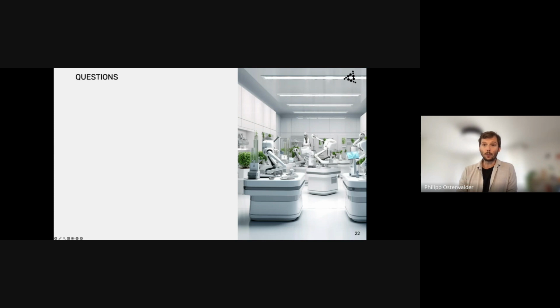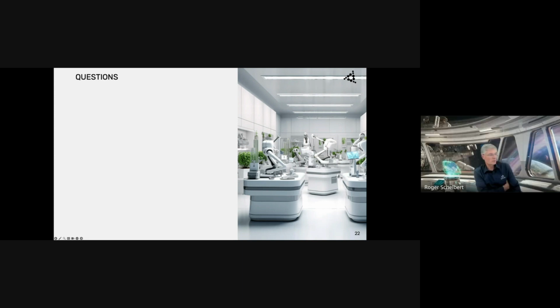We have one last question related also to the time. Does the robotic application by Arovis require the lab technicians to be trained in robotics, or does the provider Arovis handle that? So the system is built so that at the end there is no engineer or expert required.